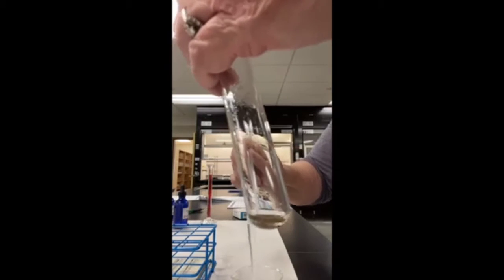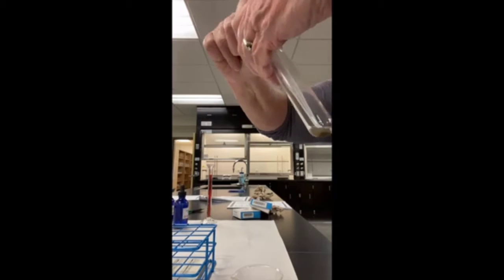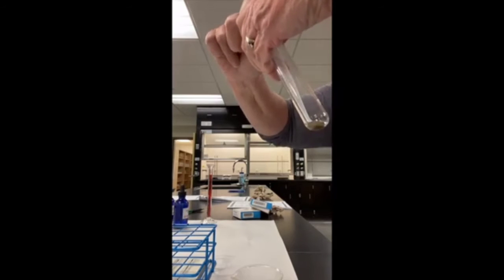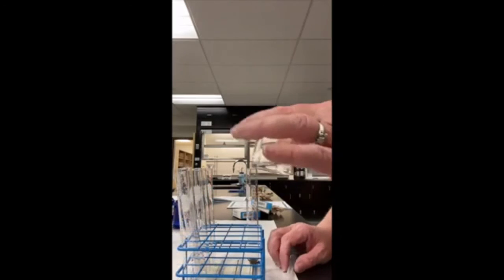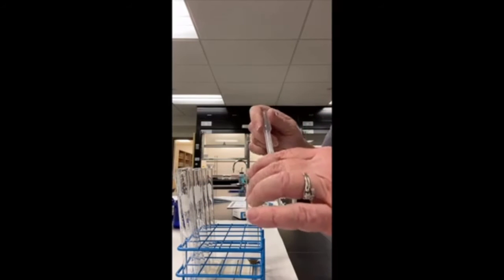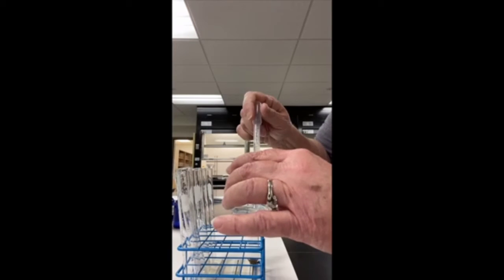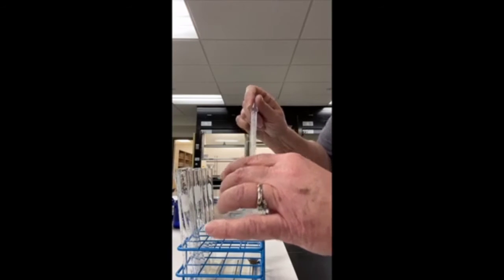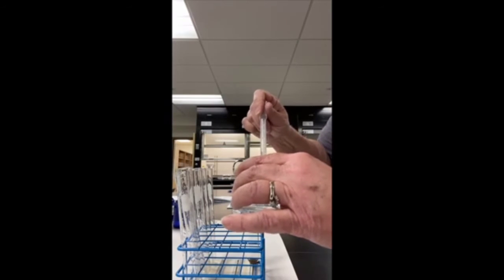And this is called decanting because I let the solid settle to the bottom and I'm only removing the liquid from the top. All right, now it looks like I have almost 10 mL, so I'm going to put about 1 mL into each one of these. The transfer pipette I'm using has a milliliter mark on it, which makes this a little easier for me to measure.